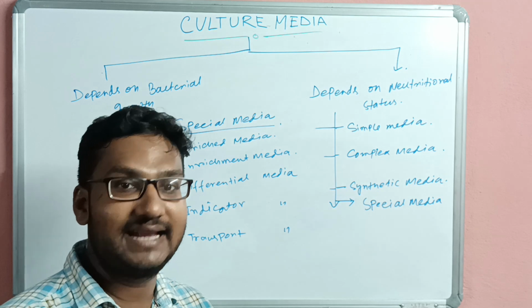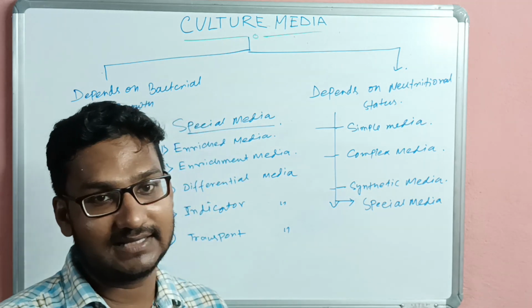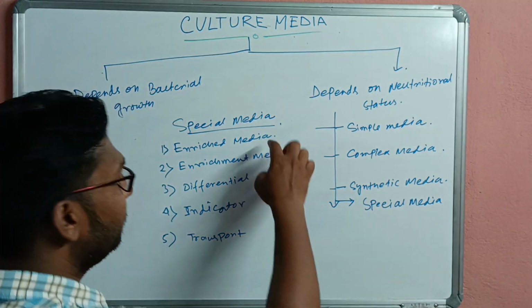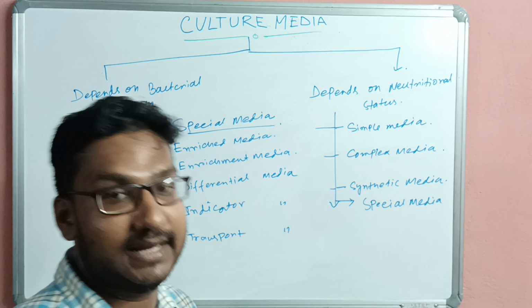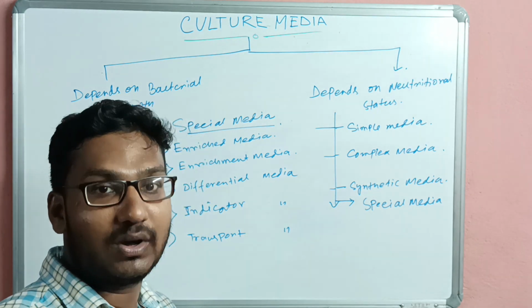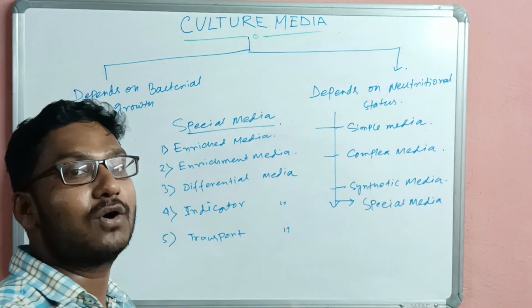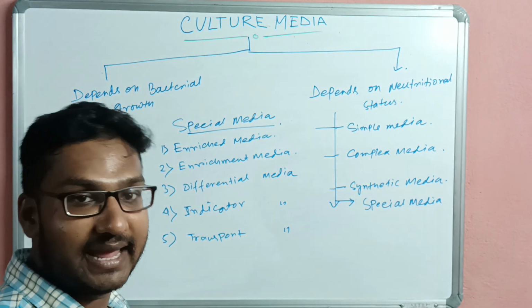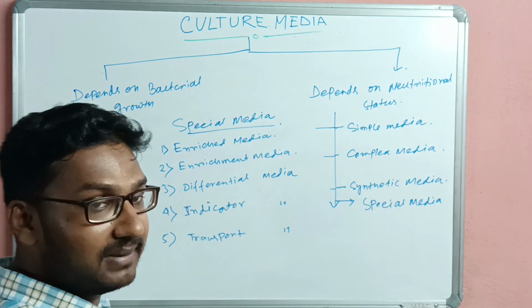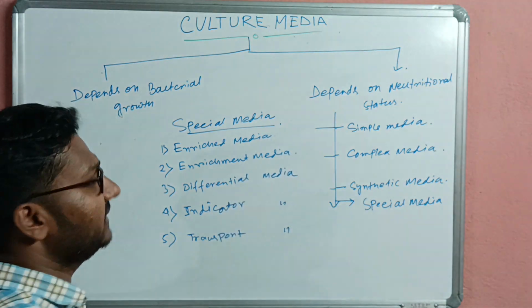For fastidious organisms this media is generally used, and it should be solid media. Examples are blood agar and chocolate agar.